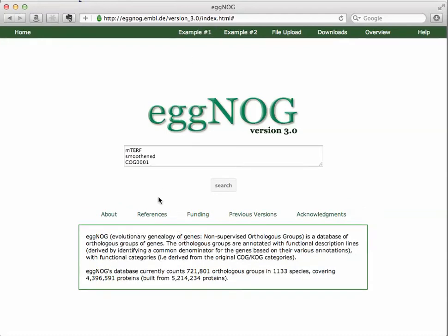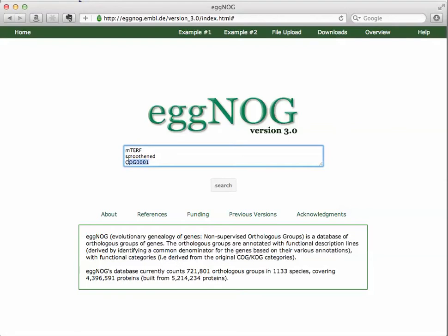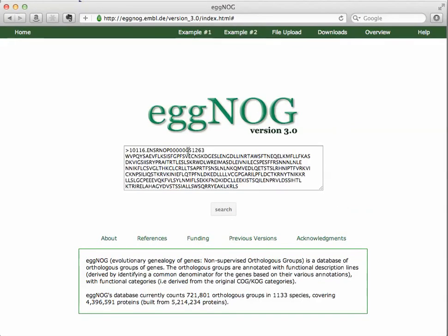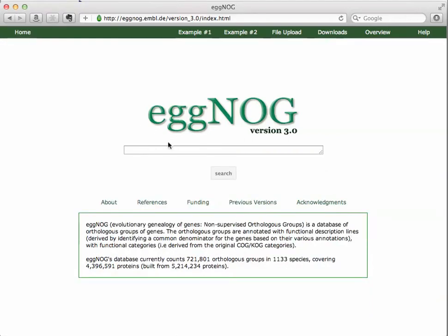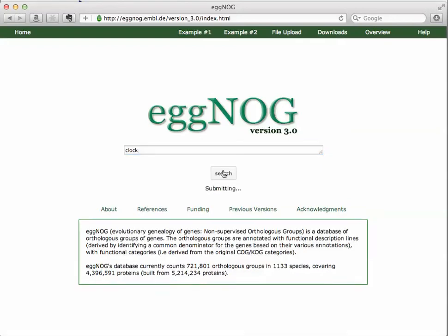There are two examples of how you could do a search. For example, here are three terms in the search, a COG term, etc., that you can do per line. Example two shows you the sequence search, so you can search by a FASTA formatted sequence, protein sequence. But we are going to just go back to the home and type in the term clock for the clock gene and click search.